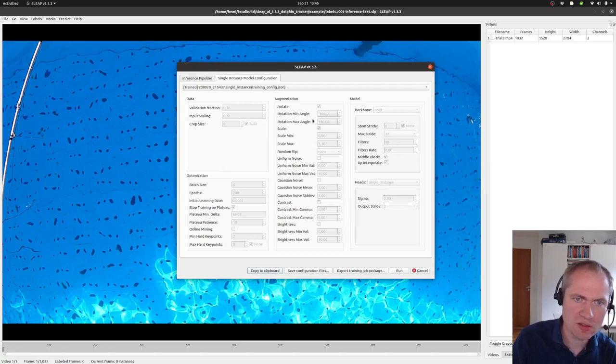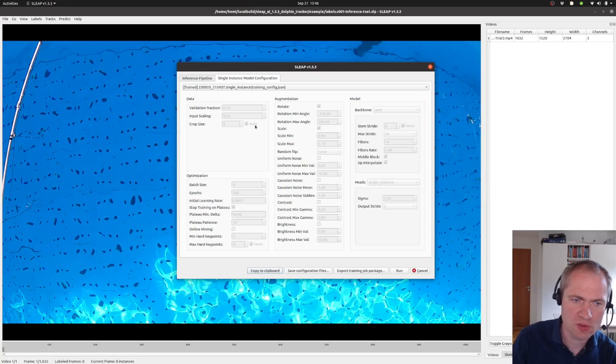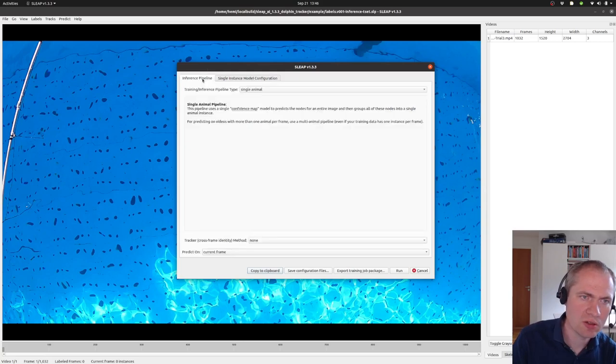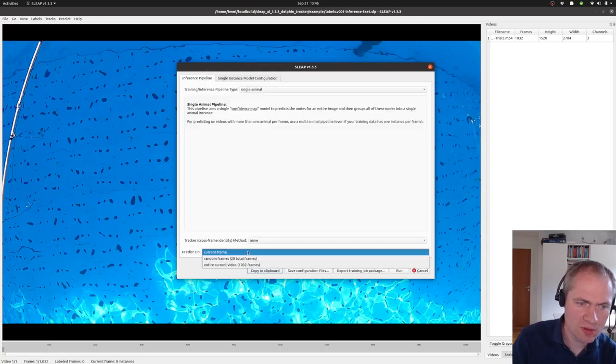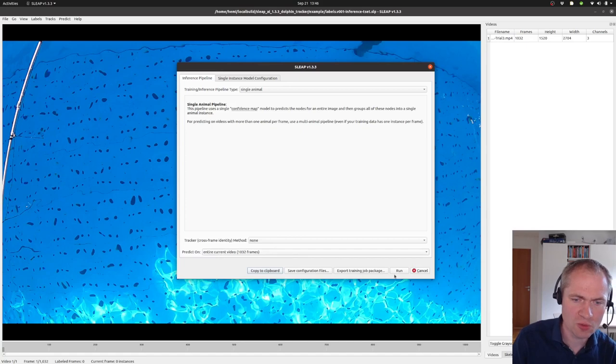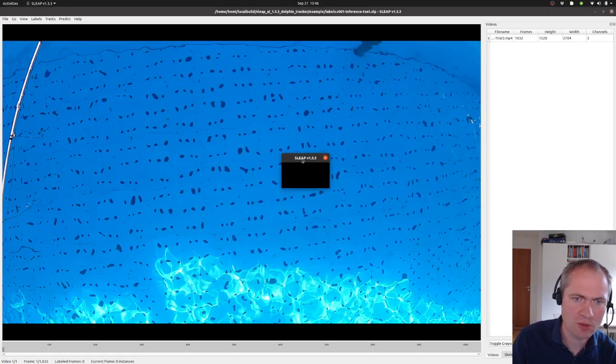And when that has been chosen, we can actually see that the values in the grayed out boxes are the same as we set them. And we can go back to the inference pipeline. And finally we can choose what should we do the predictions on. And we can simply say run.